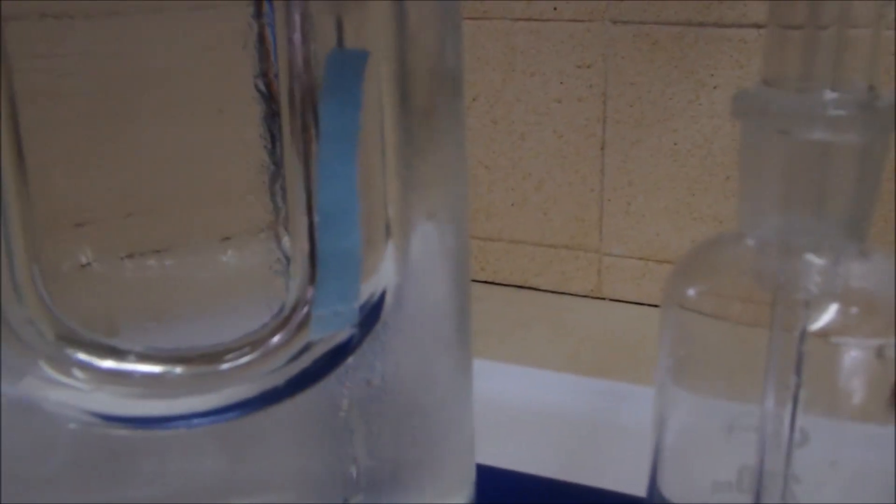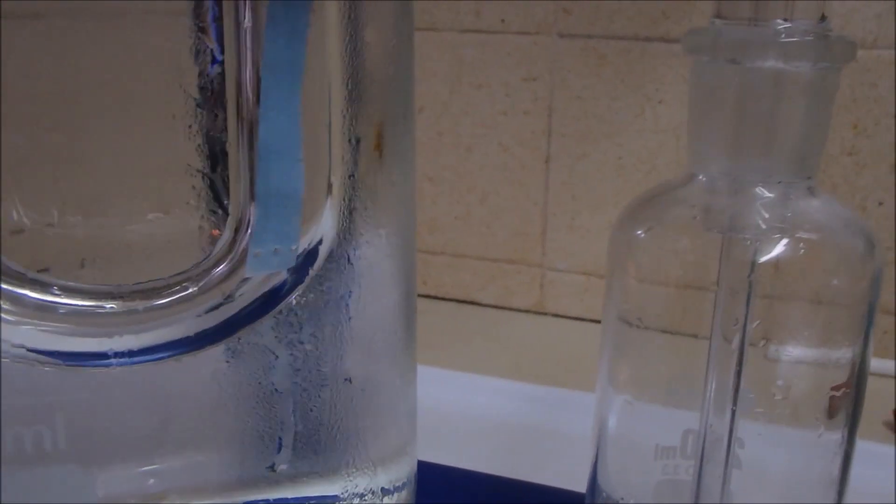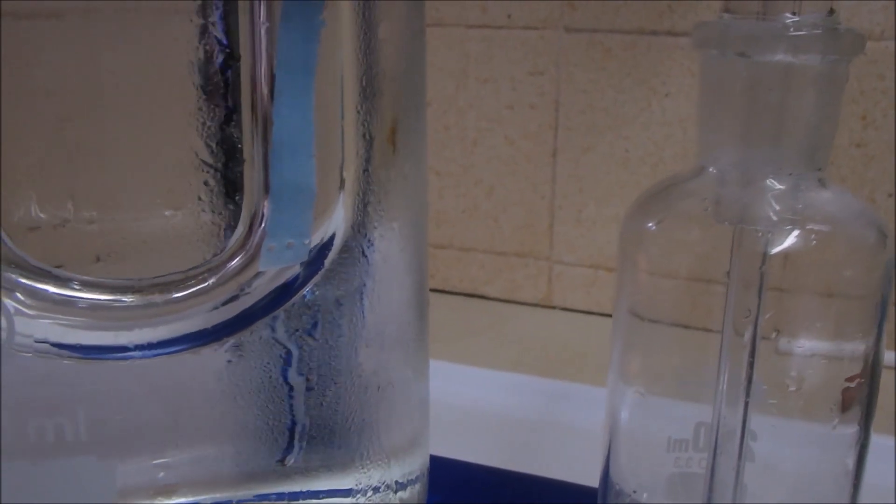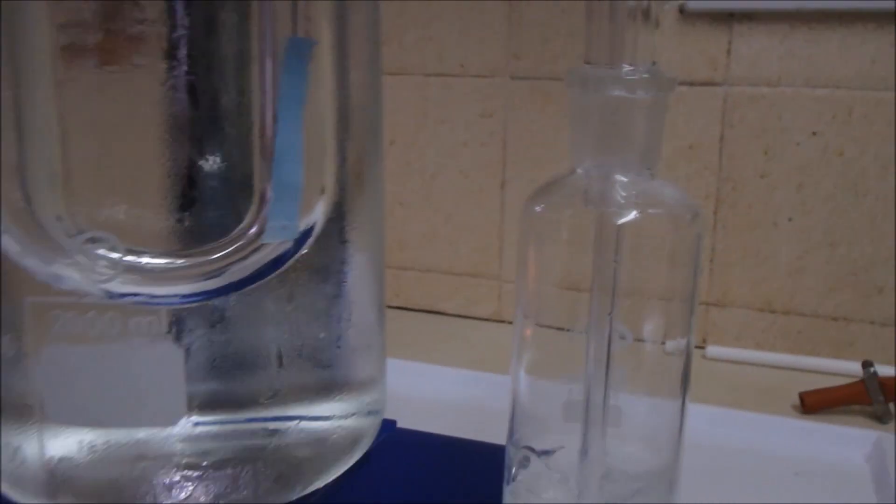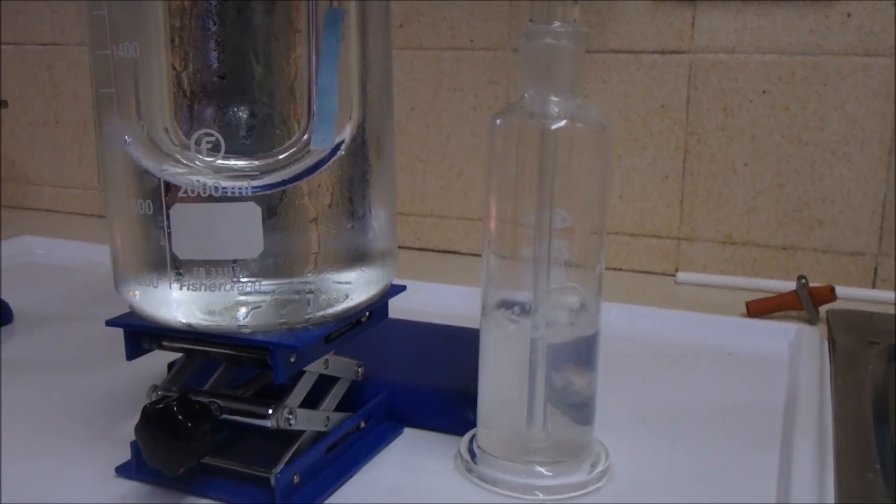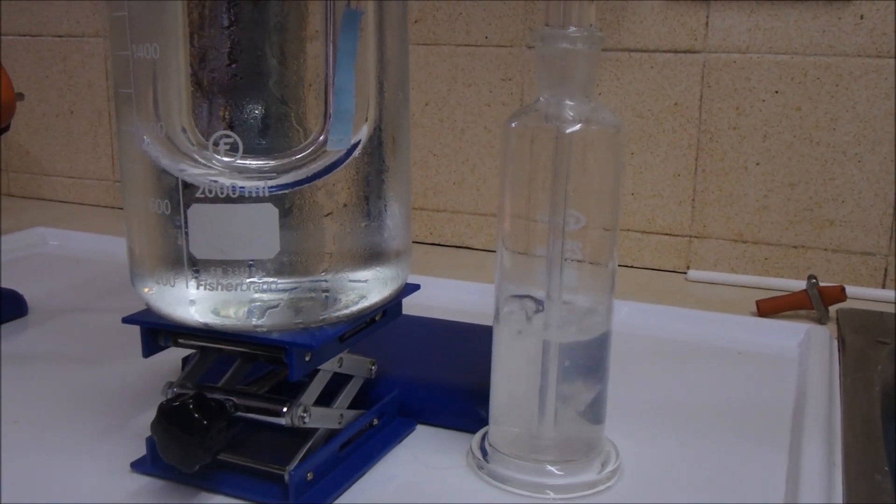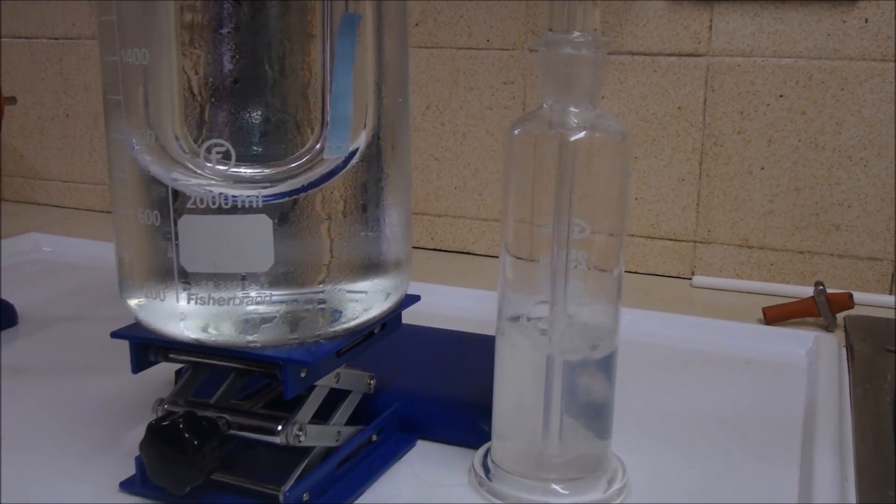So the candle's burning. Now we can look at the cobalt chloride paper. Let's see what that's doing. That's changing colour. And we'll look at the lime water and see what that's doing.